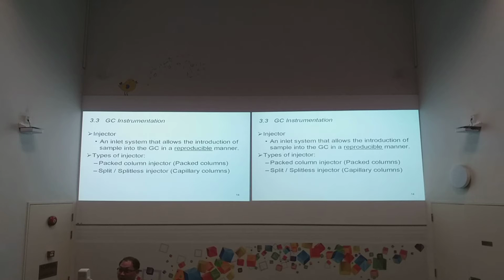Not cotton, because in actual scientific experiments we don't use cotton; cotton doesn't have the properties to give you reproducible results. So you put in all this packing material and pack it nicely, and we can install a GC column by itself and carry out the separation.